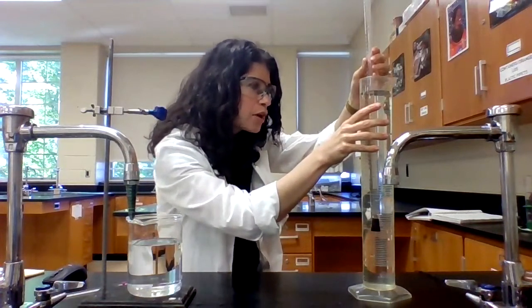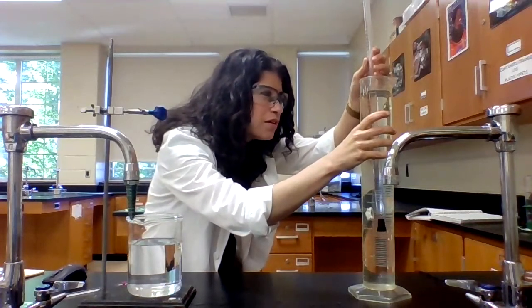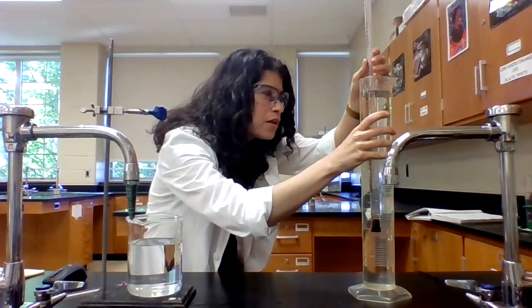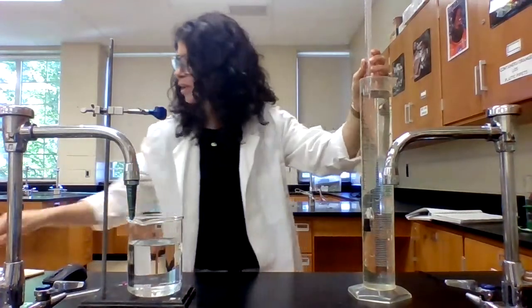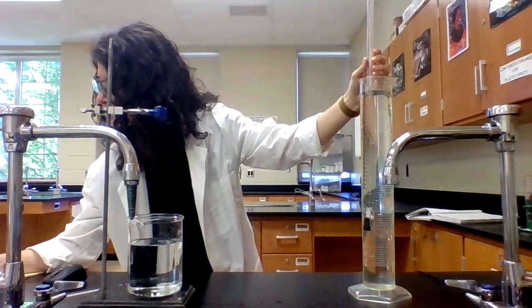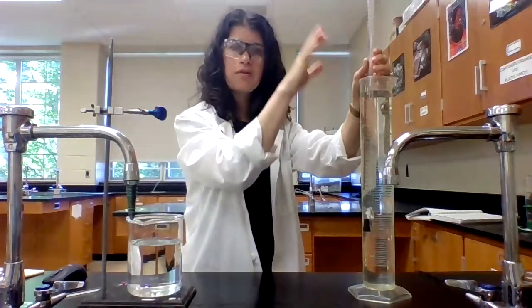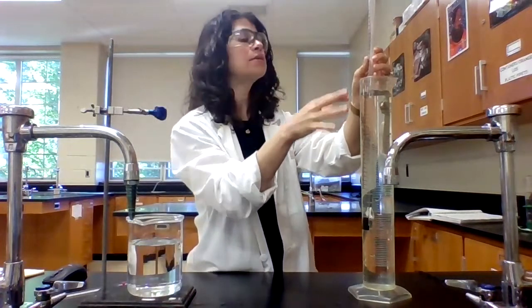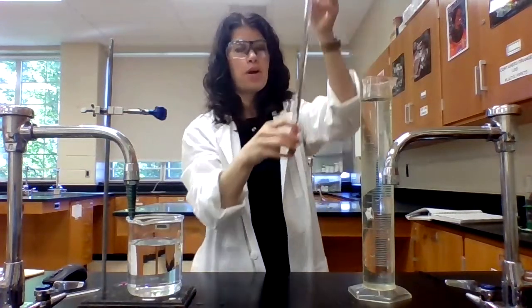Now, our eudiometer is marked more precisely than our thermometer is, so we are going to have more significant figures here. So this is reading 26.18 milliliters. So now I have the volume of the hydrogen gas. I'm going to use that and all of the other pieces of data to calculate what the molar volume of hydrogen gas would be if we were at STP.